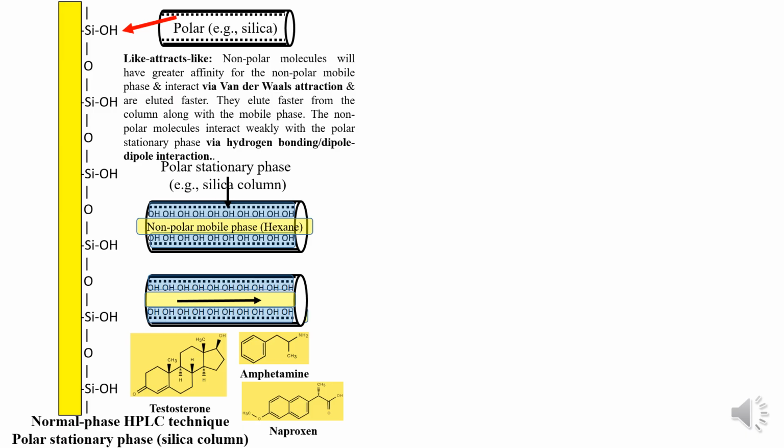Now the non-polar molecules interact weakly with the polar stationary phase via hydrogen bonding or dipole-dipole interaction. So it is not that the non-polar molecules interact only with the non-polar mobile phase. There will be a little bit of weak interaction with the polar stationary phase. That will be by hydrogen bonding or dipole-dipole interaction.